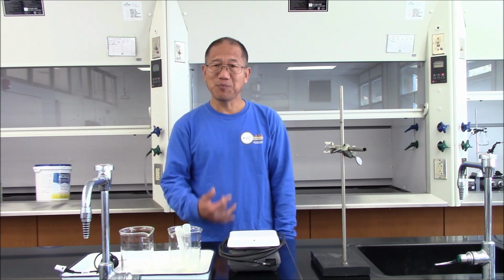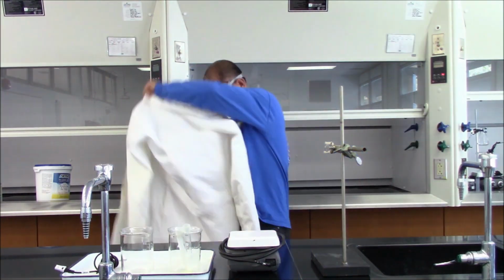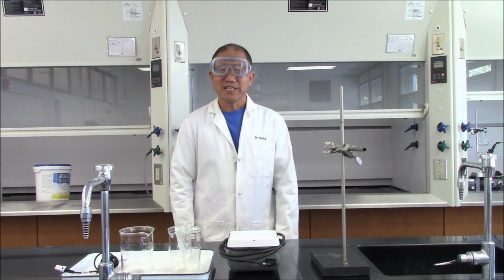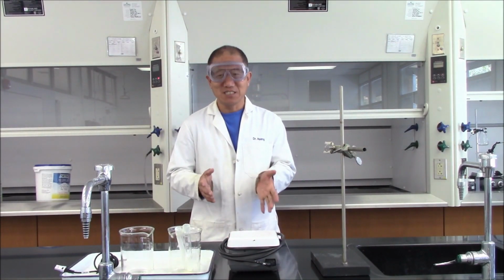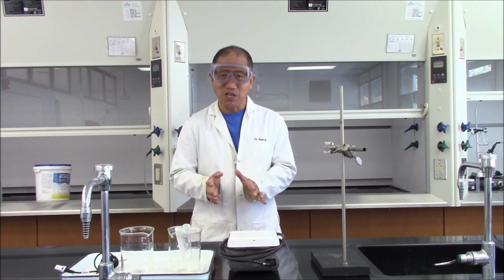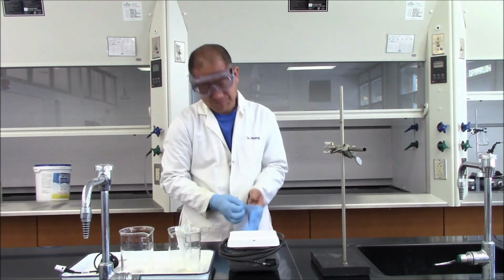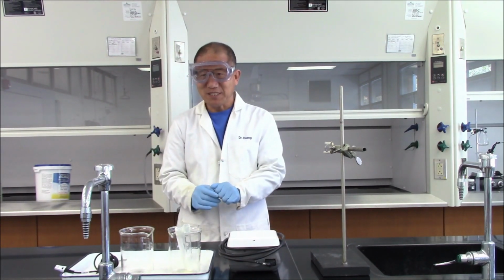Before we start our experiment, let me put on my goggles and the lab coat. I don't want my hands to touch the chemicals, so I will put on the gloves as well. Are you ready for the experiment?